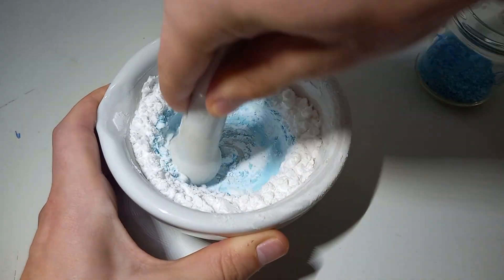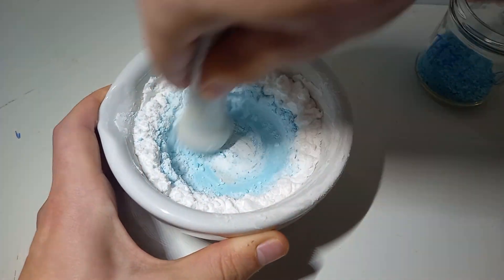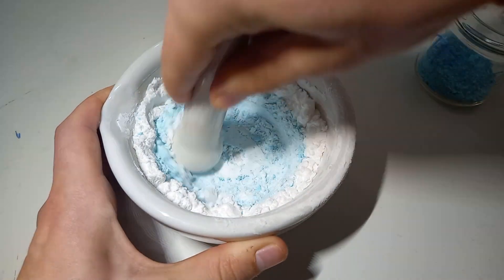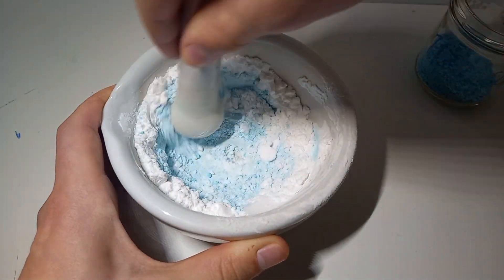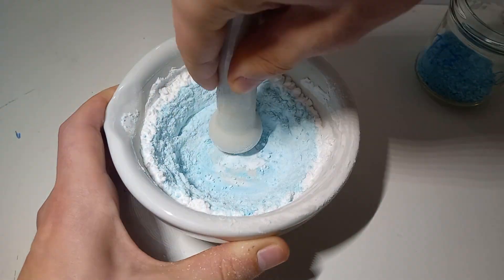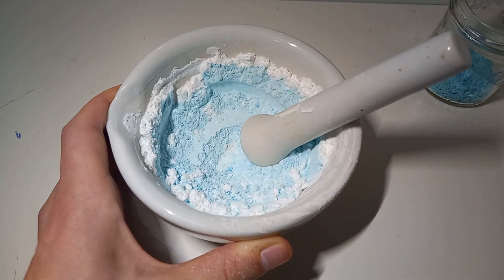The first thing I do is get nicotinic acid and add some copper carbonate to it as a catalyst, because I'm going to be dry distilling it to get the pyridine. The copper carbonate is the catalyst in this case, as I already mentioned.